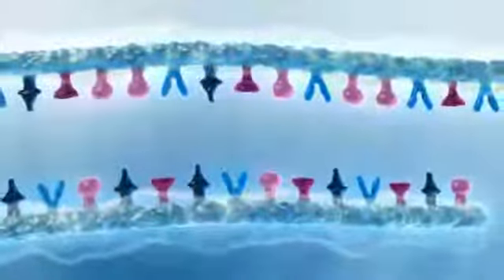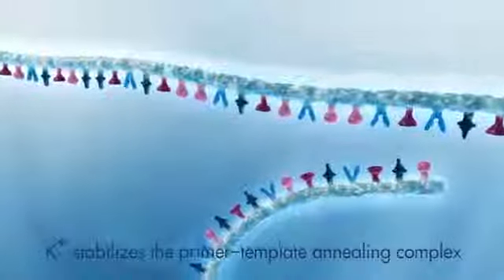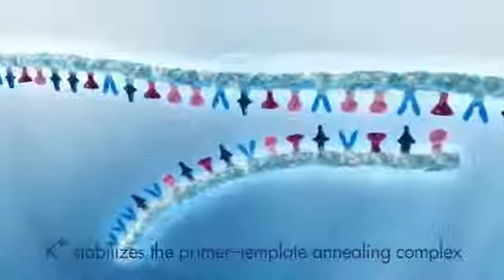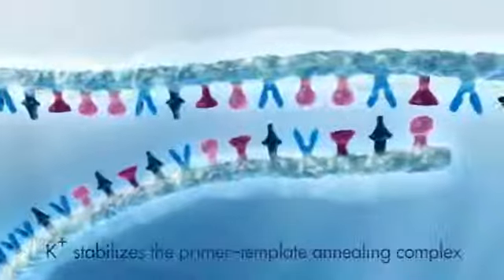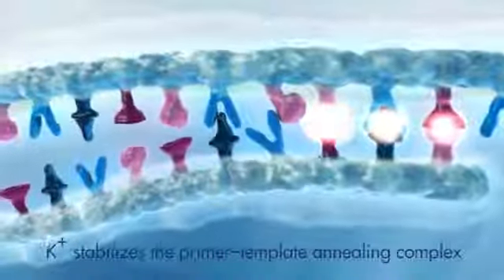The positively charged K+ ion is attracted to the negatively charged phosphate groups of the DNA backbone of the template and primer. The charges are cancelled out. The K+ ion weakens the electrorepulsive forces between the DNA template and primer molecule. The push-off effect is overcome, and the primer-template annealing complexes are stabilized.